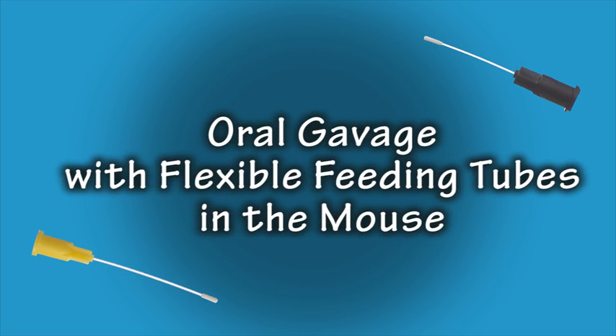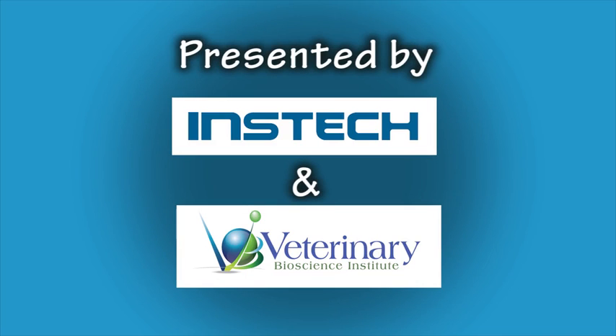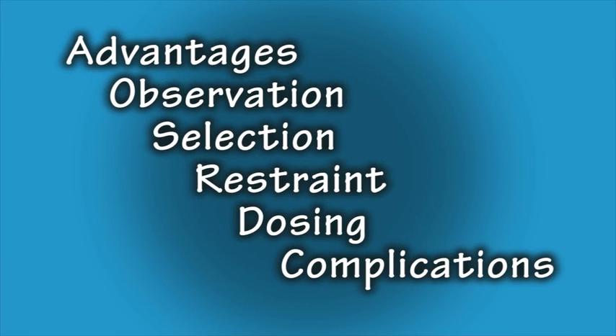Welcome to the Oral Gavage instructional video in mice utilizing flexible feeding tubes, presented by Instech Laboratories and Veterinary Bioscience Institute. This video will address the following topics: advantages of utilizing flexible feeding tubes, importance of observation before and after the procedure, selection of the appropriately sized flexible feeding tube, proper restraint of the animal, proper dosing technique, and discussion of potential complications.